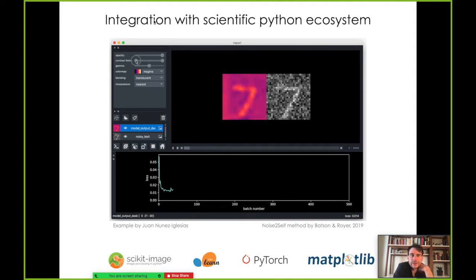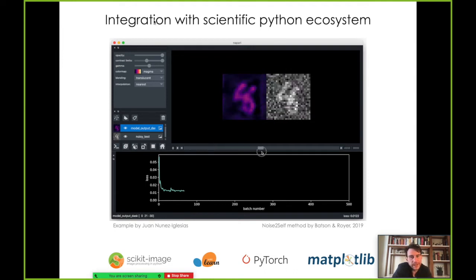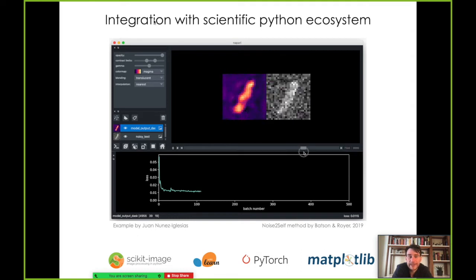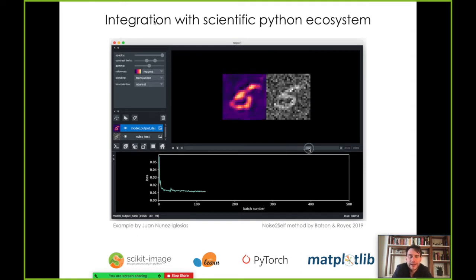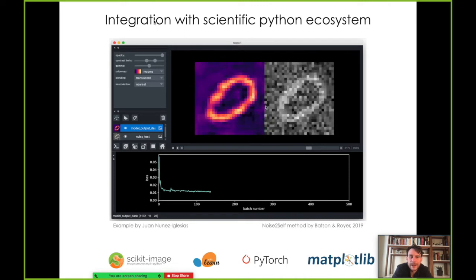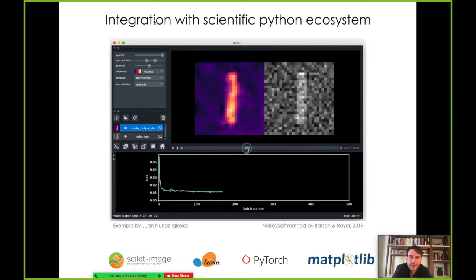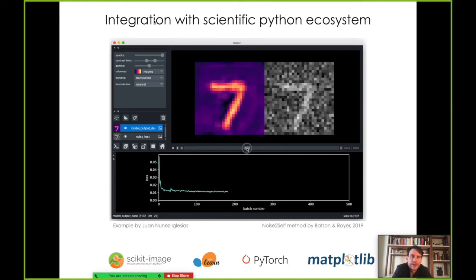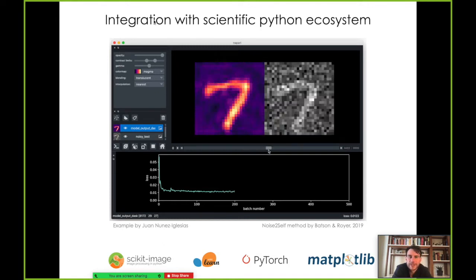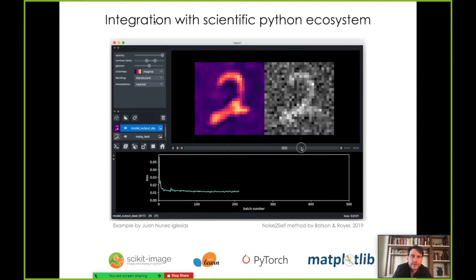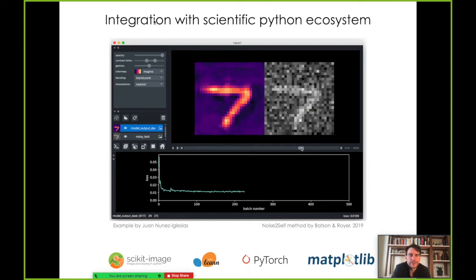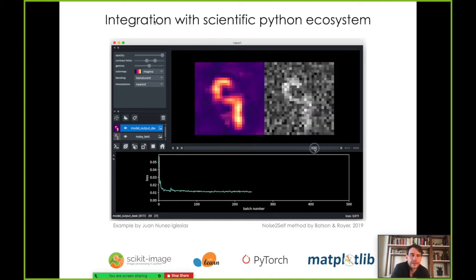Napari really tries to integrate with the scientific Python ecosystem. This great example from Juan Nunez Iglesias shows training a machine learning model in Napari — a denoising model from Batson and Rayet. It uses scikit-image for preprocessing, scikit-learn and PyTorch for the machine learning. The bottom plot showing loss against batch number is a Matplotlib plot integrated in Napari. On the right you see the raw noisy data, on the left the machine learning prediction getting better as the model trains, all while retaining interactivity.